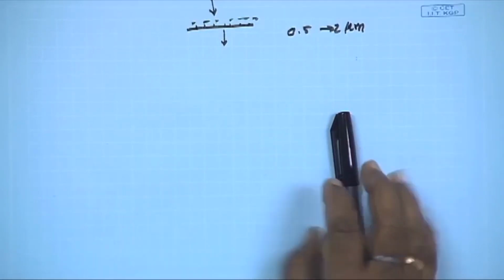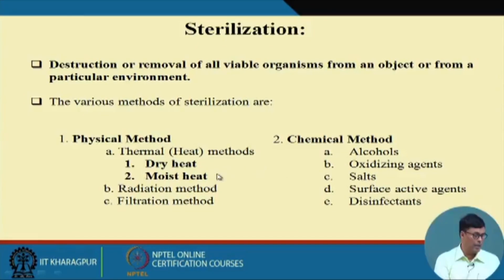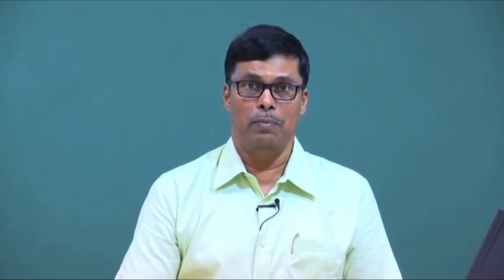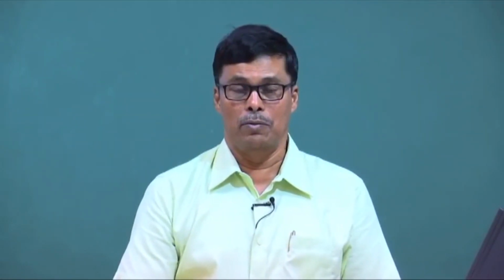Now when we consider heat as a sterilizing medium, the question comes: how is heat effective for sterilizing the media? Because when you heat the organism, it contains a lot of protein molecules, and proteins at high temperature undergo denaturation. As the denaturation of the enzymes takes place inside the organism, the biochemical activity of the organism will be stopped and your organism will be killed.